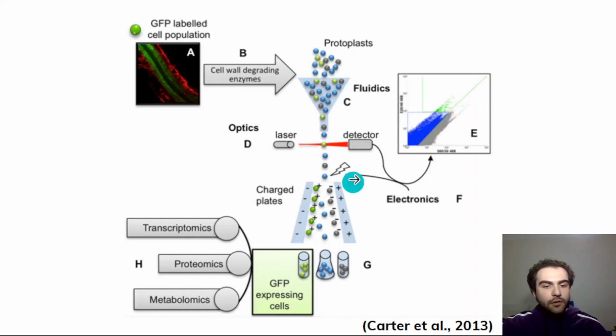Also here there are two charged plates, and with the chemicals that we use, if they are electrically positive or negative, they are being filled into different cups, and then they are being collected.